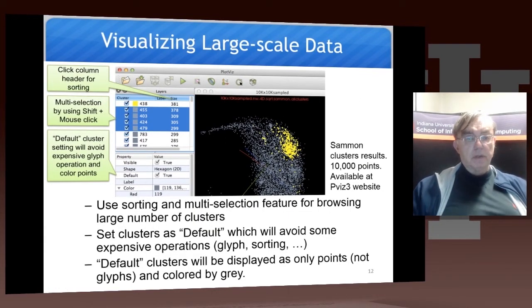This shows you some things we've looked at already. You can sort by clicking on these things here. I sorted on cluster number for the proteomics case. You have size, you can also sort on size to get the large clusters. And when you do a multiple selection, the properties of those selections are displayed below it, and you can use those properties to change those properties.